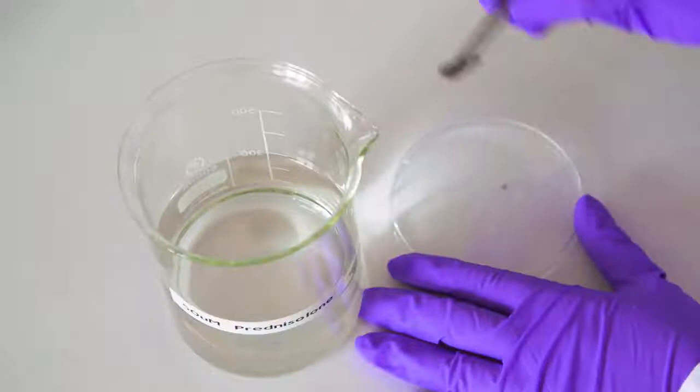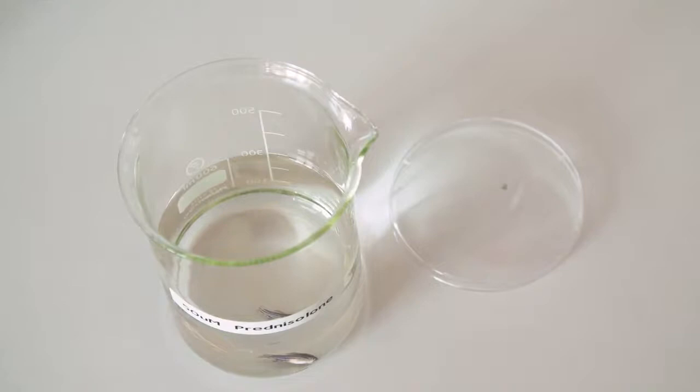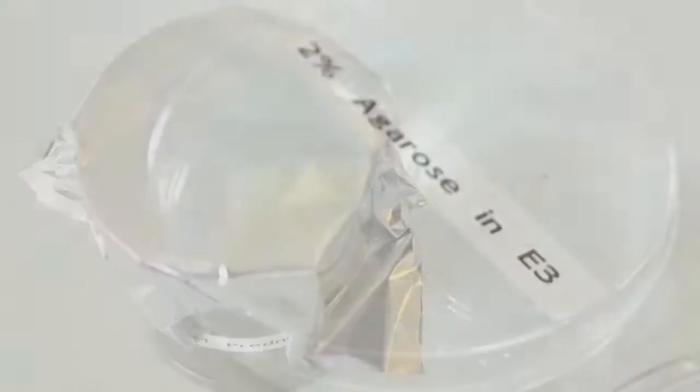Then place the fish into an autoclaved beaker containing 300ml of fish water supplemented with the appropriate experimental agent, and cover the beaker with foil to prevent zebrafish escape.